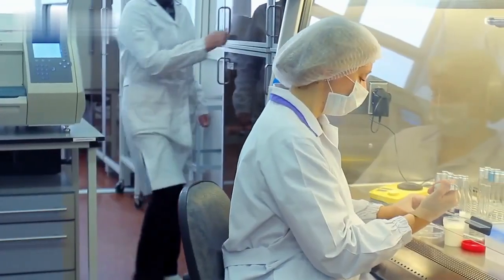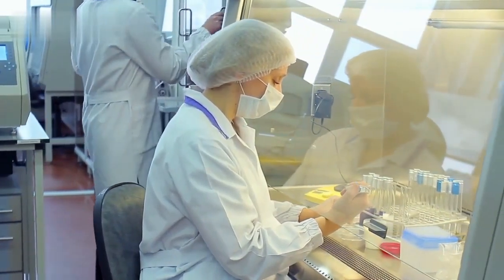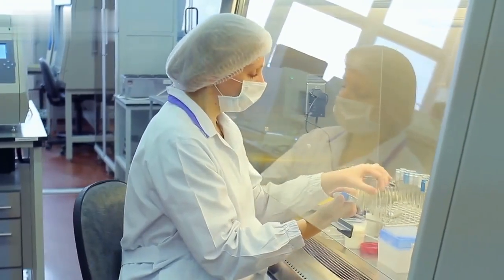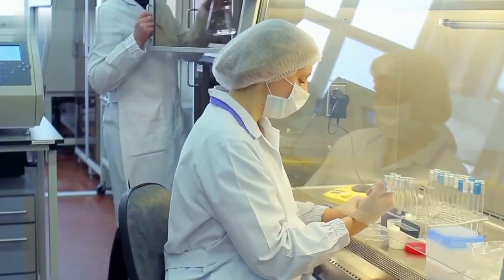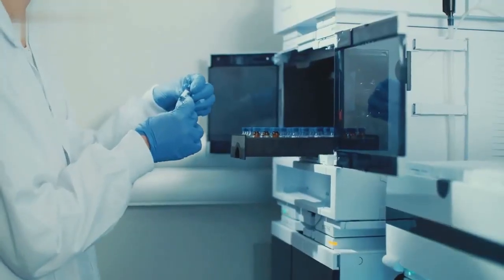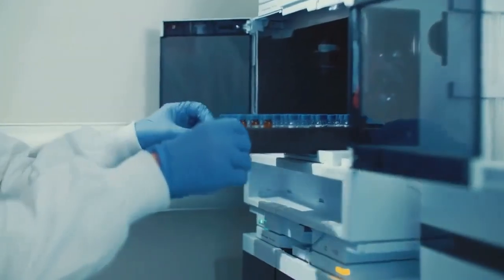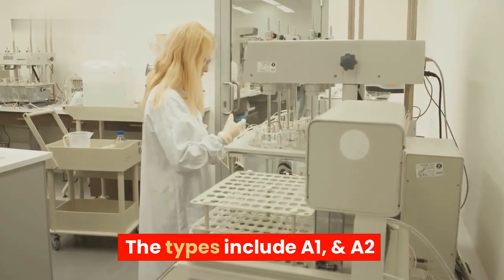Class 2 BSCs are designed with an open front with inward airflow, personnel protection, downward HEPA-filtered laminar airflow, product protection, and HEPA-filtered exhaust air, environmental protection. These cabinets are further differentiated by types based on construction, airflow, and how they interface with exhaust systems. The types include A1 and A2.